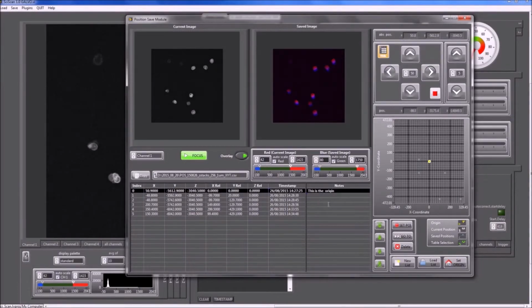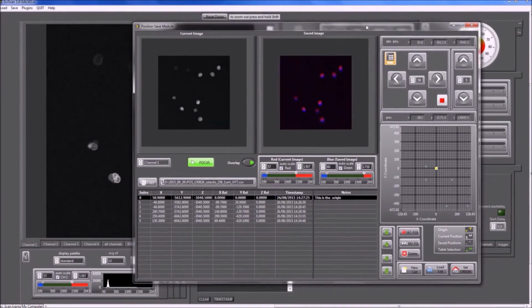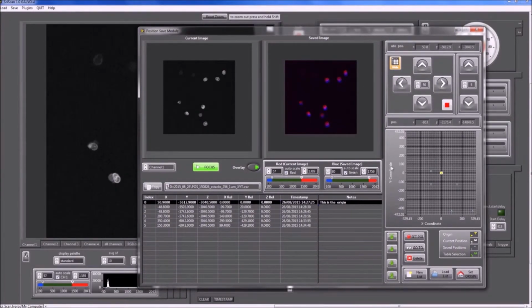to your updated origin. So if you would like to annotate a position, what you do is click on the nodes corresponding to the position and you can type in your annotation. So I'll just type in note 1, and if you click outside, that note should get saved.